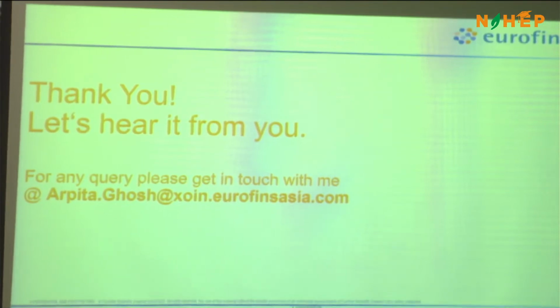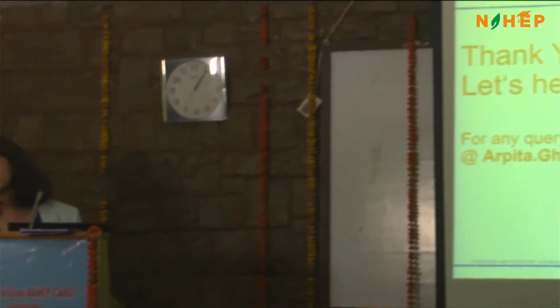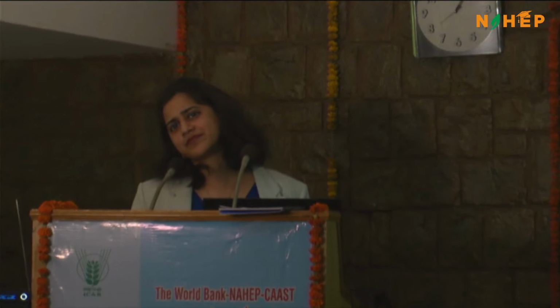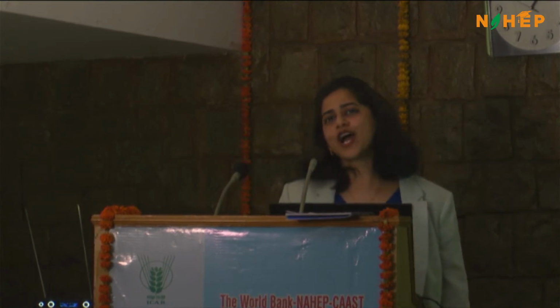Ma'am, I have a question about metatranscriptomics. If I am doing metatranscriptomics shotgun sequencing, can I use the data and get ASVs from metatranscriptomics? See, what do you understand by ASVs? In metatranscriptomics also the 16S gene is getting sequenced. But do you have the guarantee that the 16S of all organisms has been sequenced there?